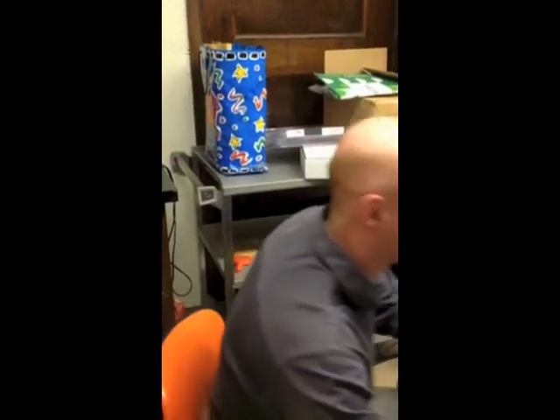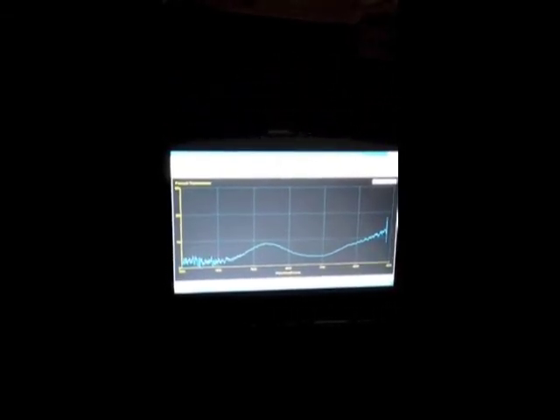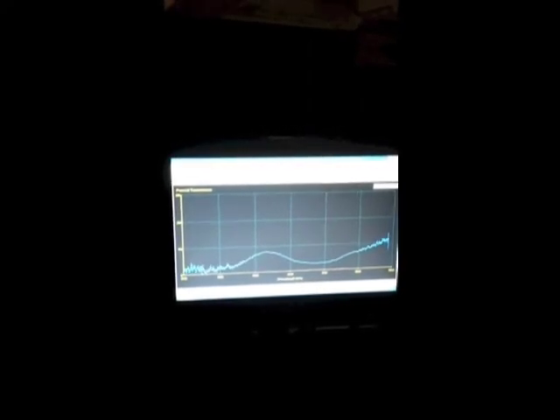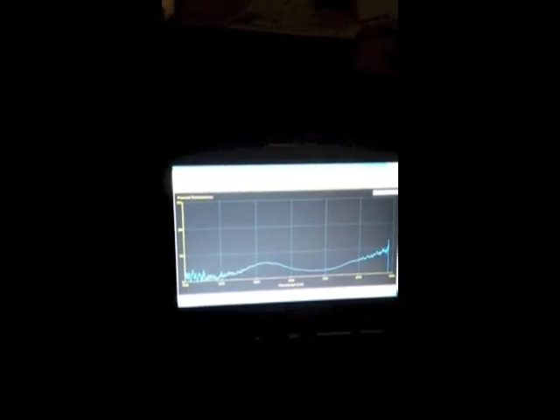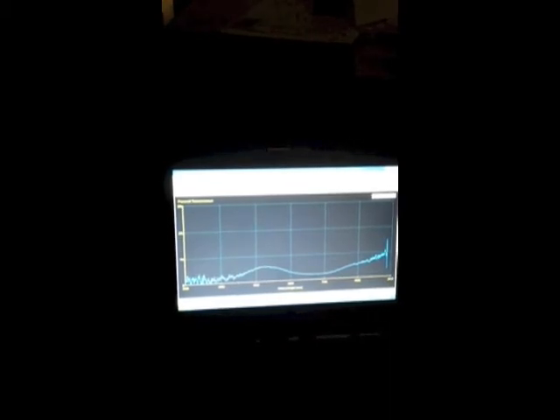Thank you very much. So if we hit the lights, we can see the spectrum on the screen. And so this is a relatively low reflecting feather, so not a lot of brightness. But with the change in angle, we can see that it actually reduces in brightness. And in this case, there's not much of a change in the peak, so basically there's no change in the hue.